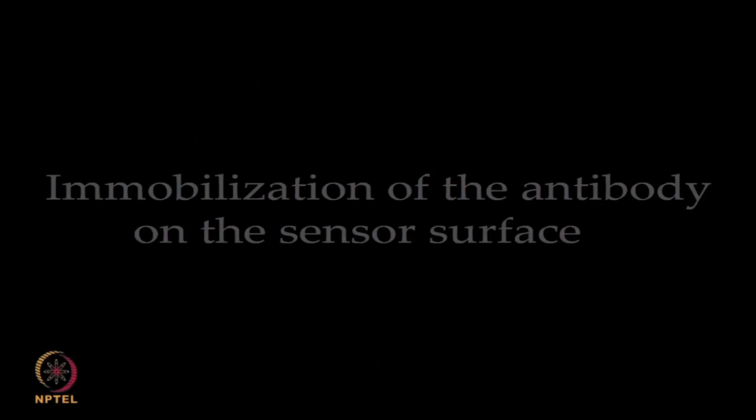Good morning one and all. Myself Sushailendra Vaidya from Pall Corporation. I am going to give a demonstration on how we can use this BLI technology in quantitation. Now I am going to demonstrate the experiment, the quantitation of the apolipoprotein using an antibody against the apolipoprotein.